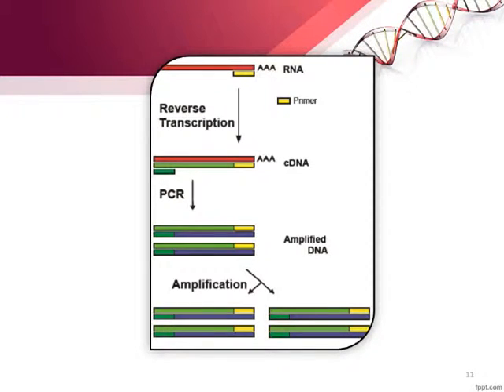The first step in RT-PCR uses reverse transcriptase and a primer to anneal and extend a desired mRNA sequence. If the mRNA is present, the reverse transcriptase and primer will anneal to the mRNA sequence and transcribe a complementary strand of DNA. This strand is then replicated with primer and Taq polymerase, and the PCR protocol is followed for a smaller amount of time to produce a significant amount of copied DNA.